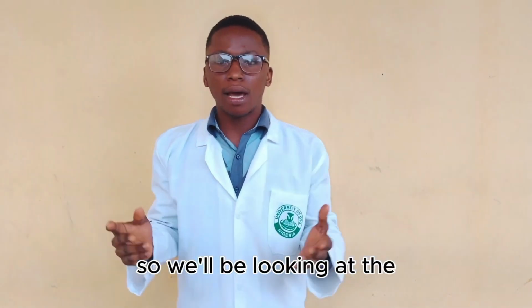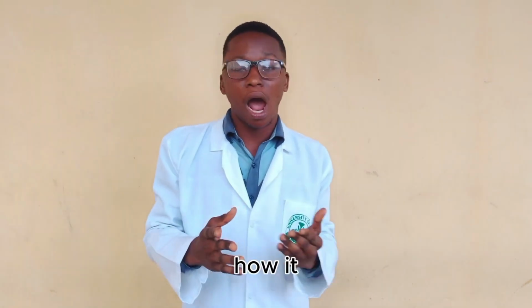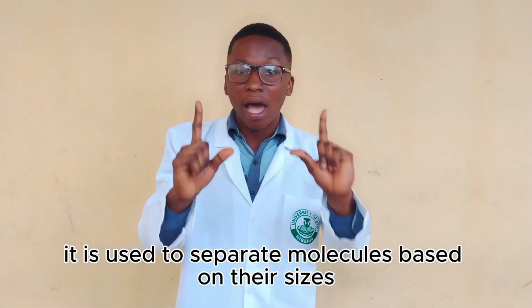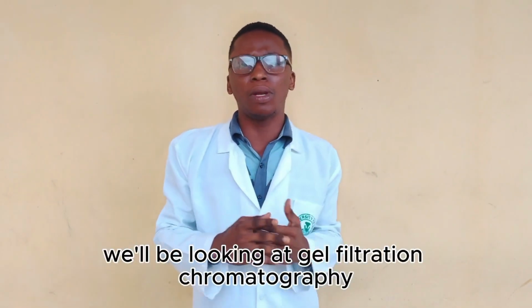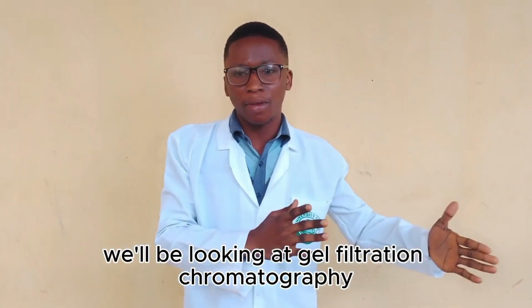So we'll be looking at how polyacrylamide gel electrophoresis is used to separate molecules based on their size, charge, or conformation. In terms of size, we'll be looking at gel filtration chromatography.